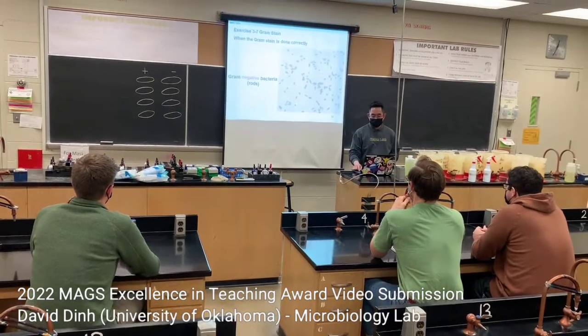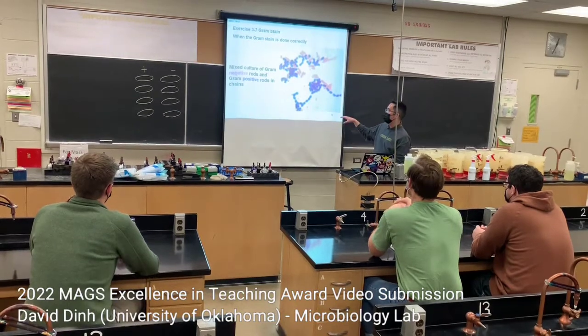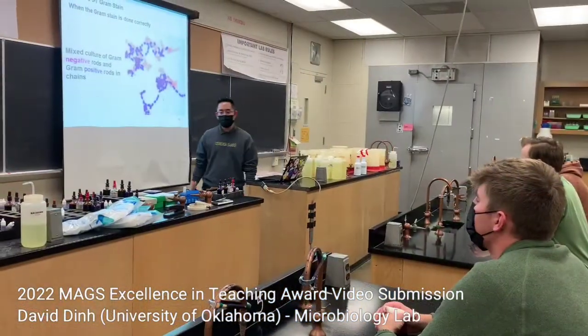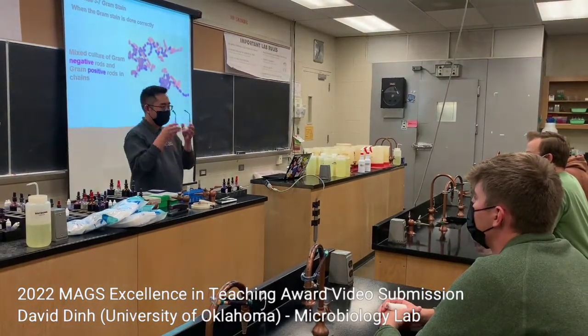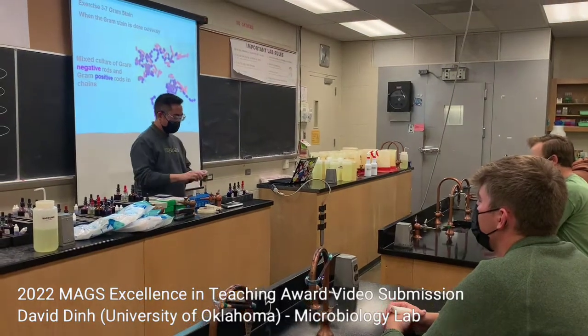And then here's a mixture of both organisms. So today we're going to use a mixed culture, so you should see both purple cocci and pink rods. Okay, so I'm going to do the demo for today, just briefly. So always remember to wear your safety glasses in class. So I'm going to put it over my glasses. And then turn on the Bunsen burner.